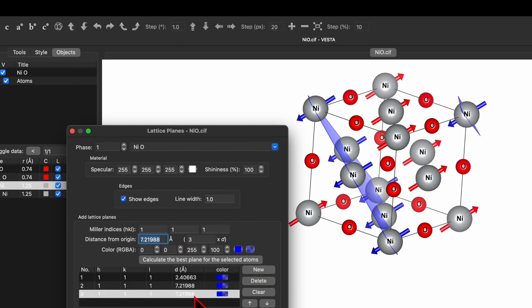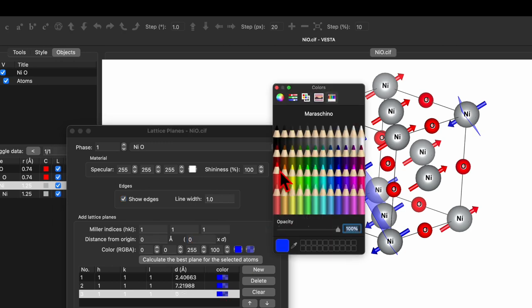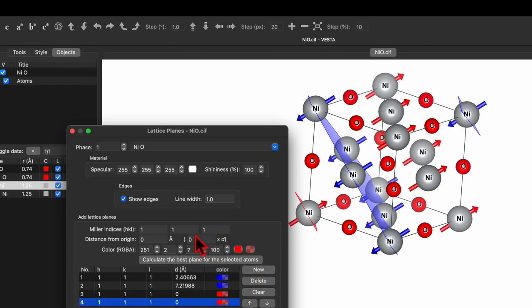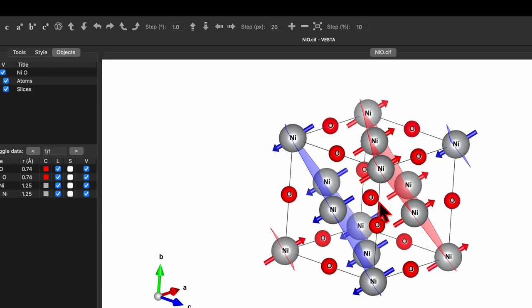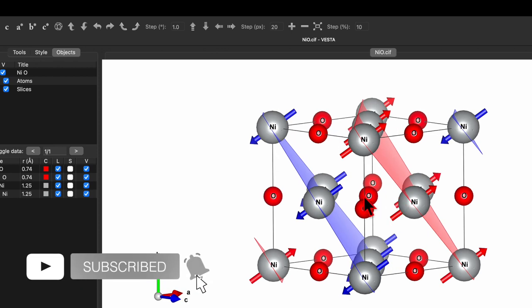Create one more plane — this time d-value is 0 and the color of the plane is red. You can set the transparency by tuning the transparency number. Then one more plane with d-value 2. In this way we can create the unit cell of nickel oxide with vectors and also the planes.